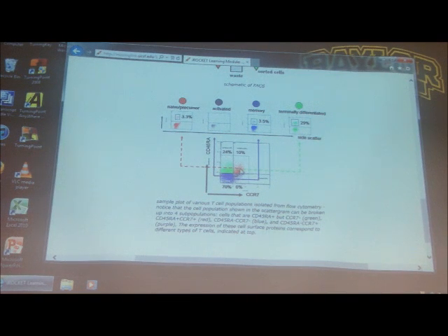This population has a great deal of both antigens displayed on the surface. This one has only CD45RA displayed on it, very little of the CCR7. This one has a lot of the CCR7, but very little of the CD45RA. So we have 4 different populations that we can distinguish. And this is very commonly used. Okay? Well, that's flow cytometry.